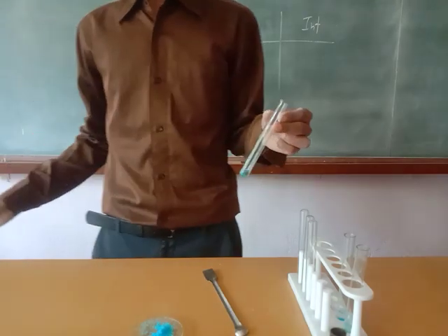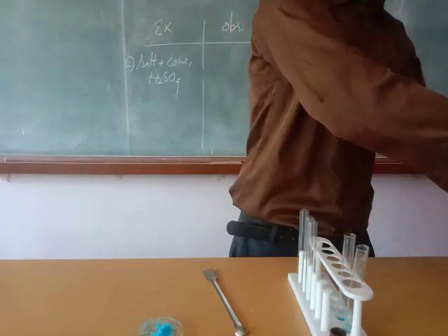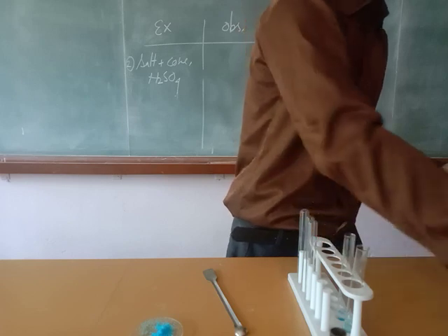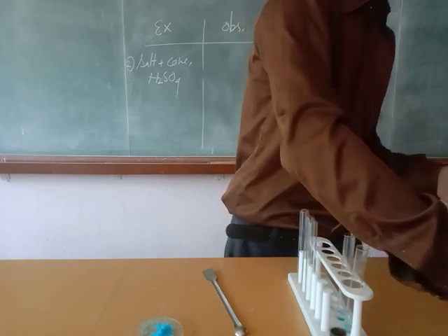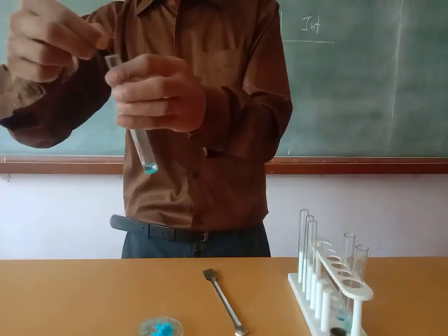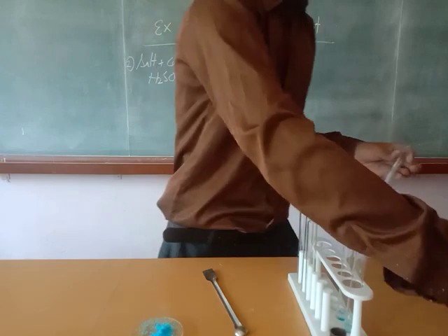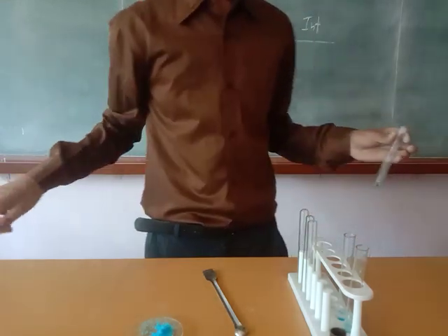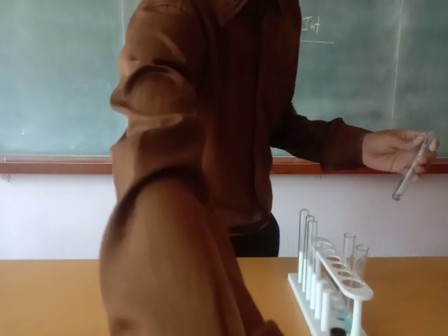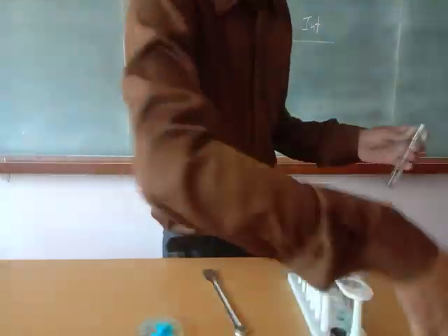At room temperature, if there is no observation, then we have to do one thing. We have to add a piece of copper turnings here, then you heat the sample in Bunsen burner. So this is our, wait for a minute.